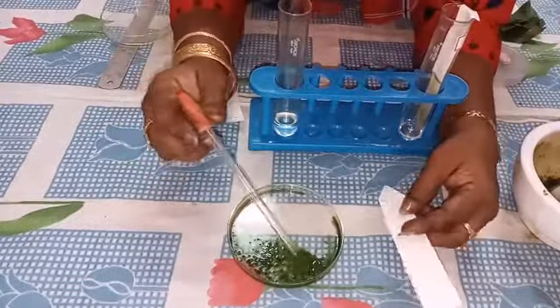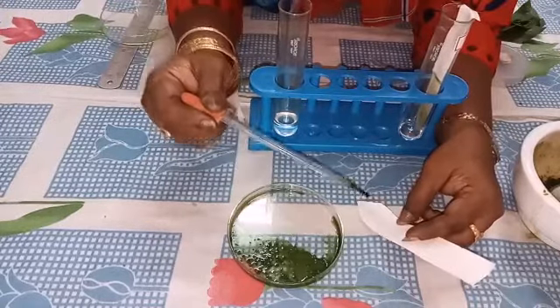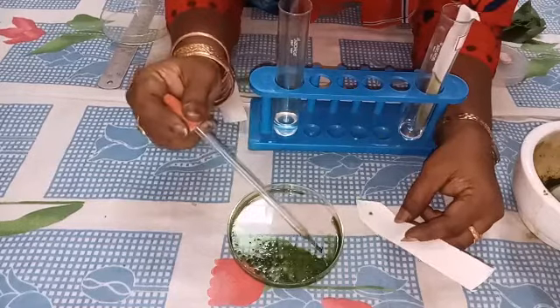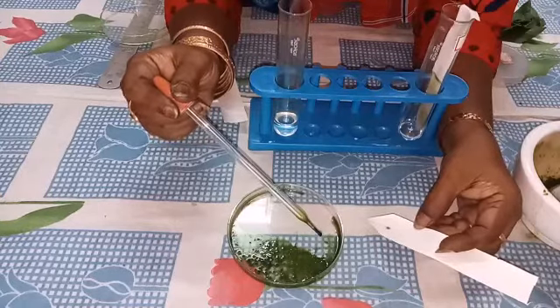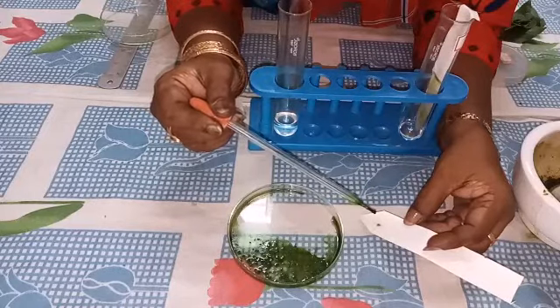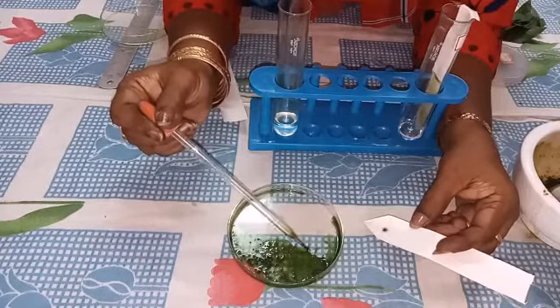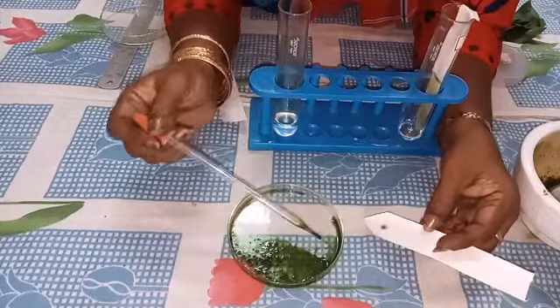Then from this extract, we have to take and keep it on the line at the center — one dot. Again, one more dot. Like that, we have to keep 5 or 6 dots.